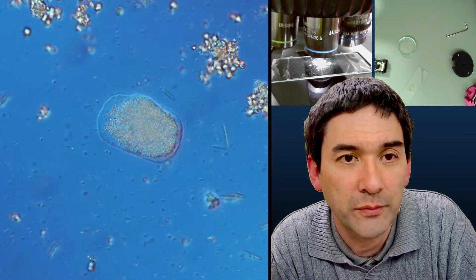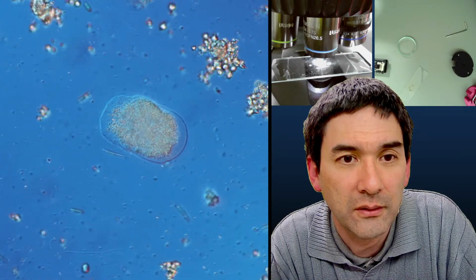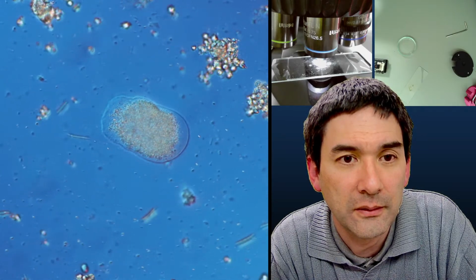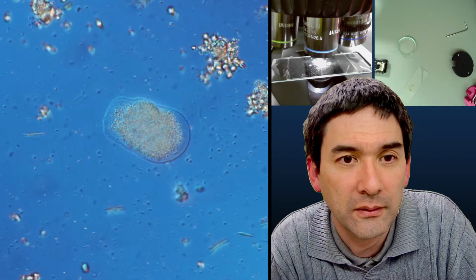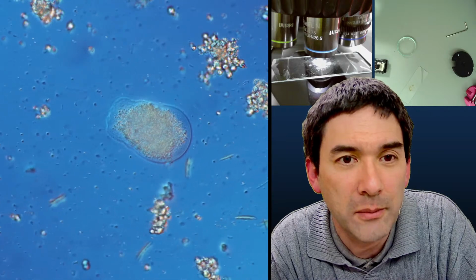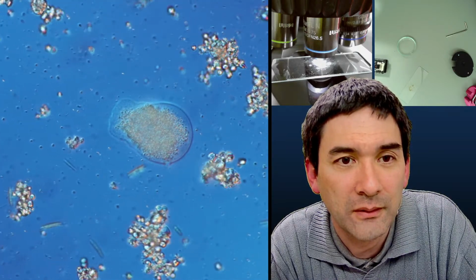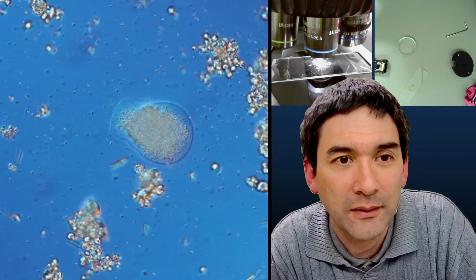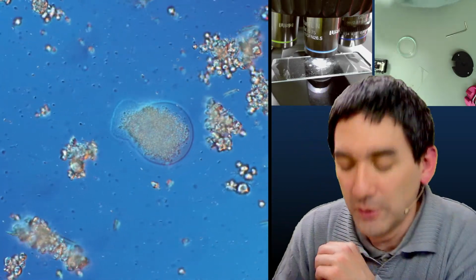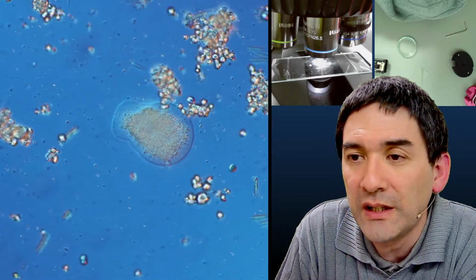There's now even some movement inside the cell happening. Look, what is it doing? Could this be an amoeba maybe? Interesting. Yeah, so carmine is indeed a common stain used for DNA staining.